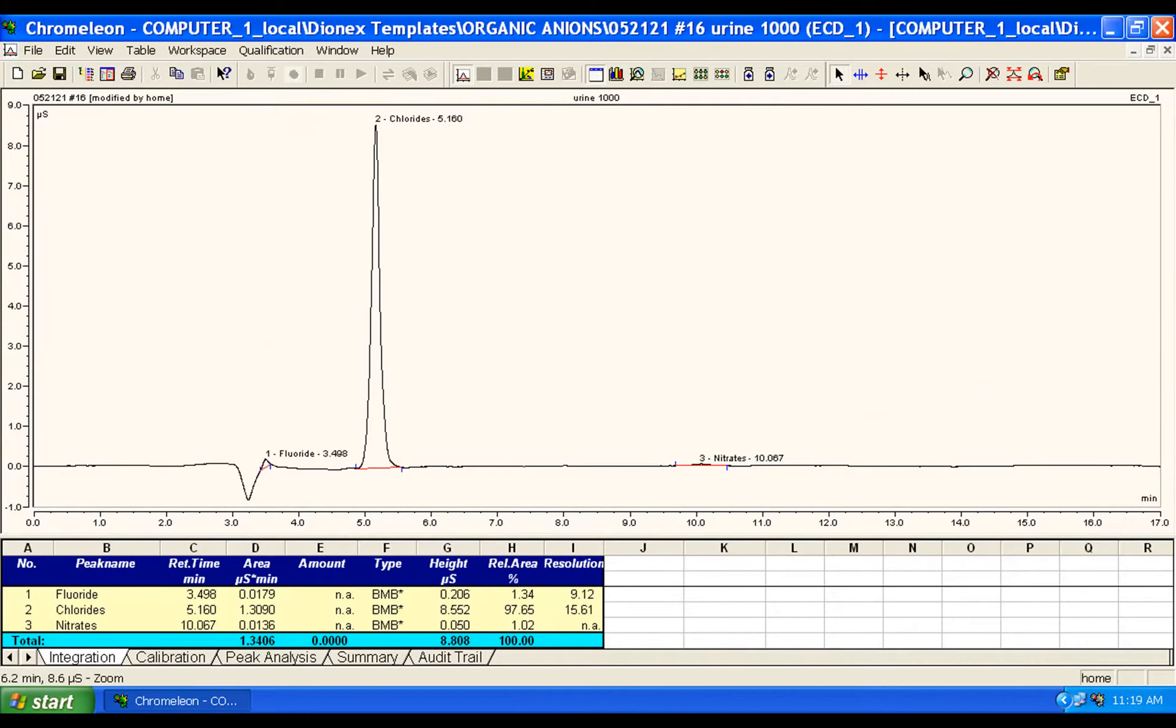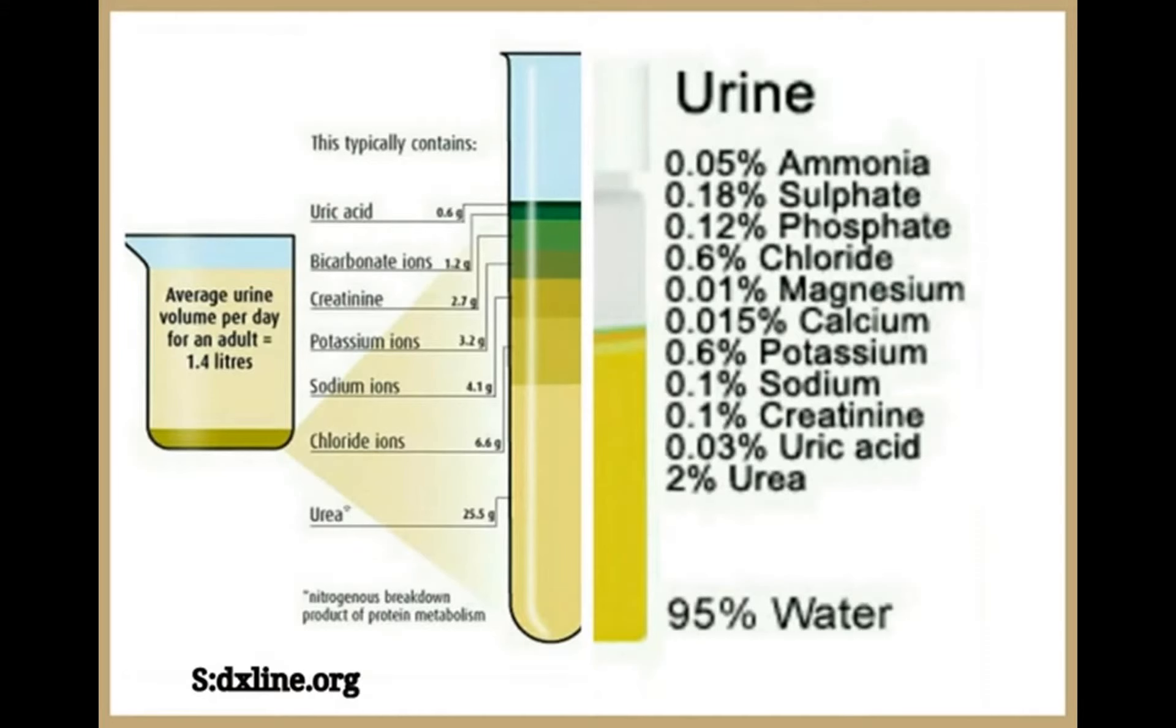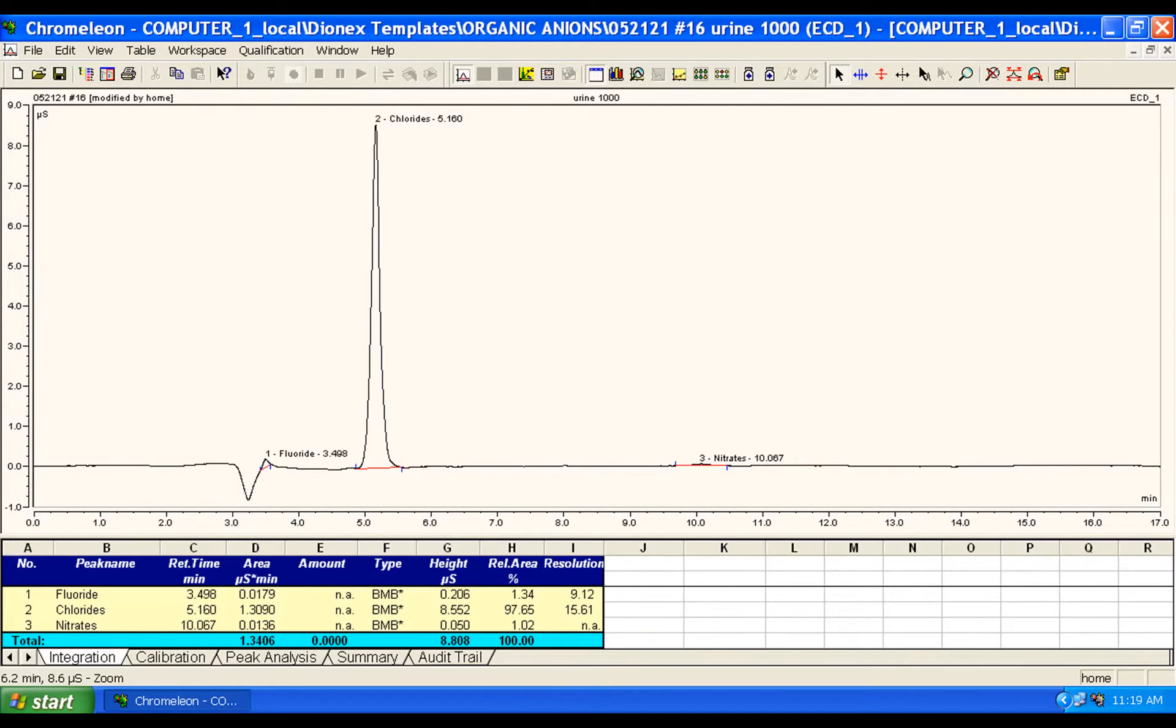Still a lot of chloride in urine, and comparing with the other column shows the same peak further away from the chloride. I could not determine if this was actually fluoride, oxalate, urea, or something else, like lactate. So this will have to remain undetermined for now.